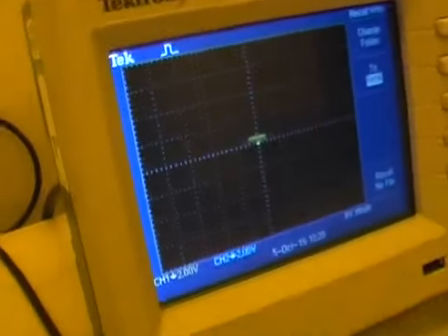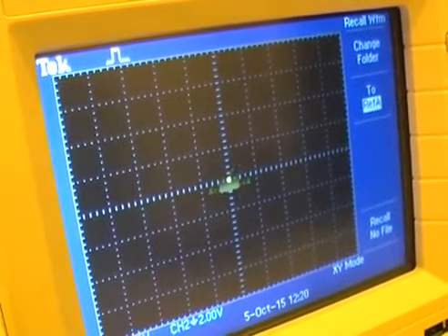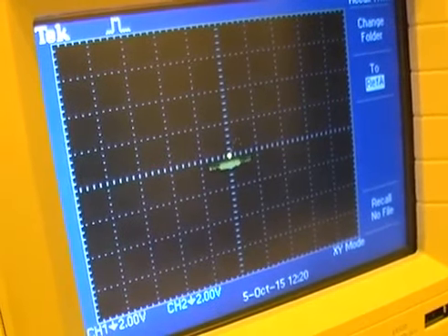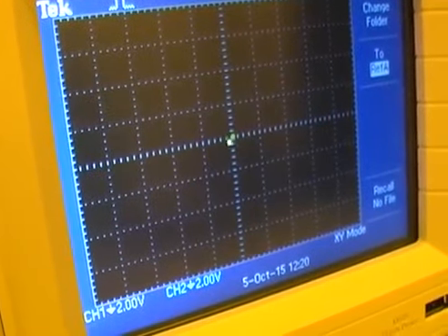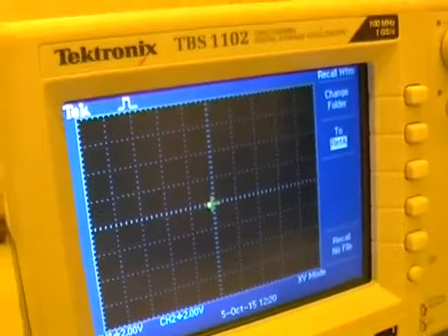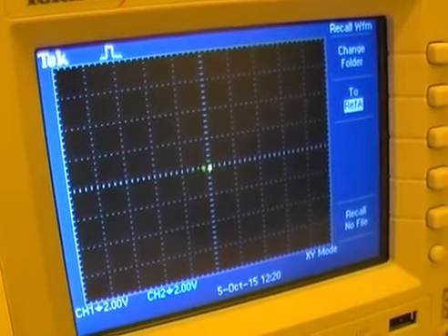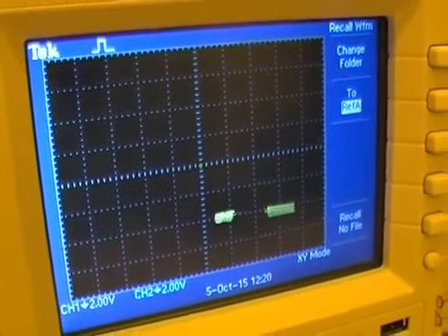So that gives you, it's doing the video adjust. So it's scanning the beam across your video adjust sample. And now it's taking photographs of the video adjust region and the cross, which you always get in your job. And the next thing, it will start looking for the 4 markers, and you can see it doing marker searches. And it looks like it's finding them reasonably happily. So it does a coarse search where you see the big cross on the screen, and then does the fine search, and now it's writing the pattern.